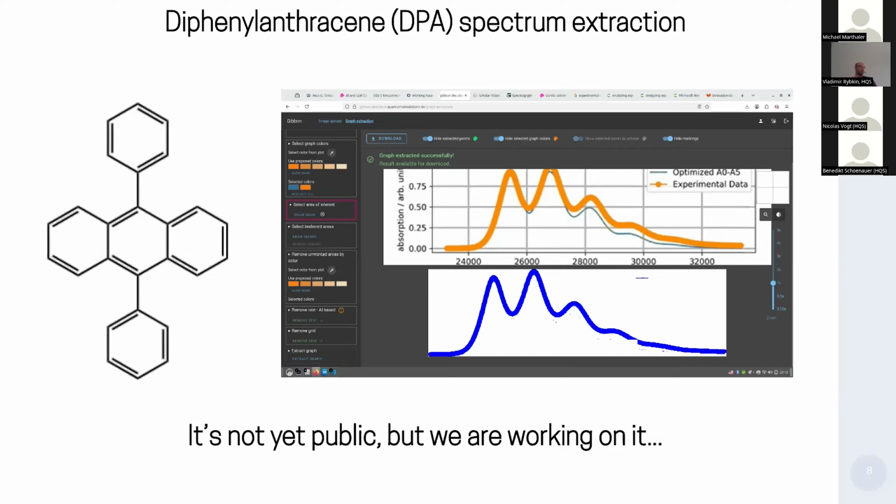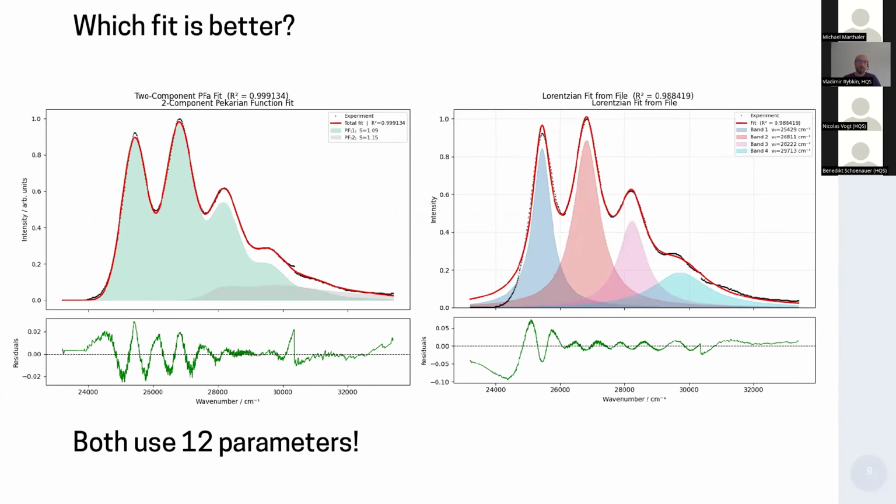And before we try to apply our 2 fitting procedures, let us ask ourselves a question. What do we see here? Do we see 1, 2, 3, 4 peaks? Are these vibronic data, or are these purely electronic lines? Maybe anything. We don't know. That's what I mean by having things well informed. We may try to distinguish it by actually performing the fit. And that's what we see.